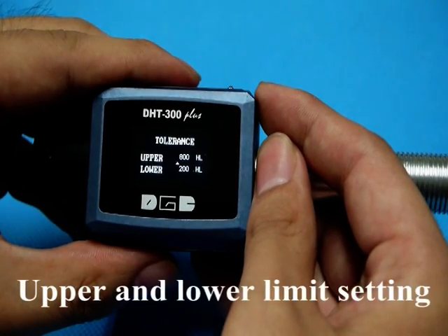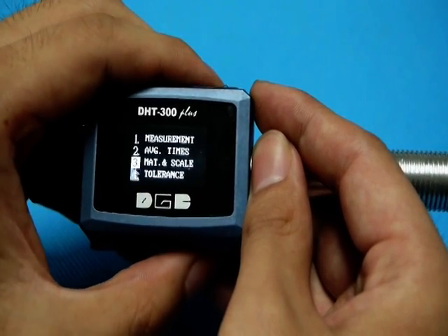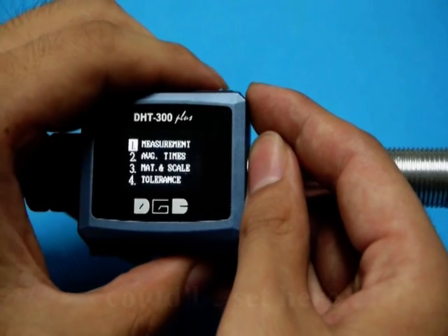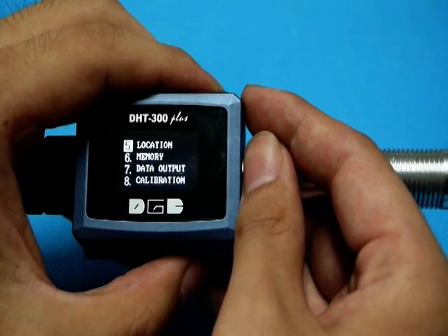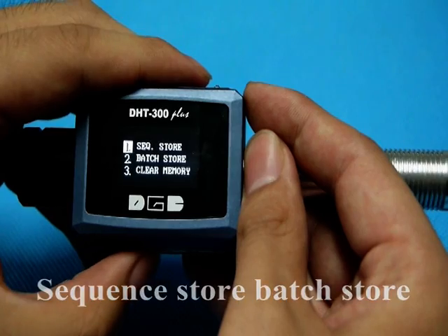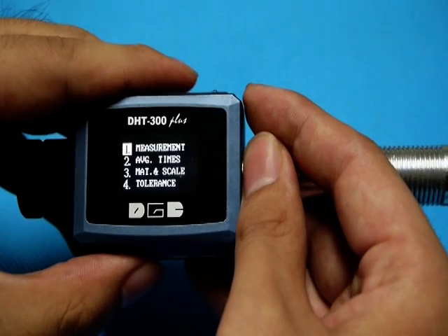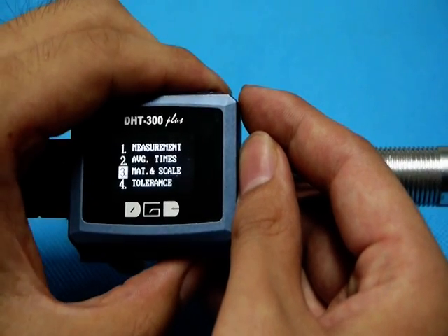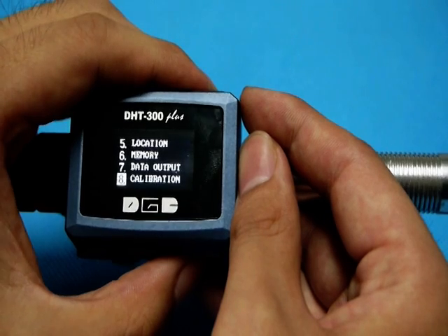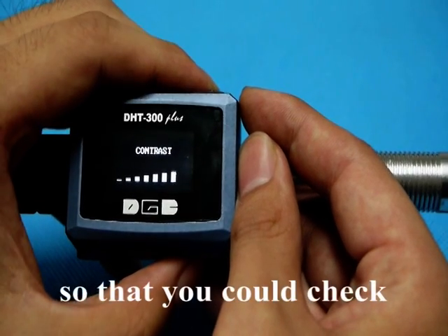Upper and lower limit setting is for quality quick check in the production line. Store location could be set here. You could also make changes to the contrast so that you could check the result clearly.